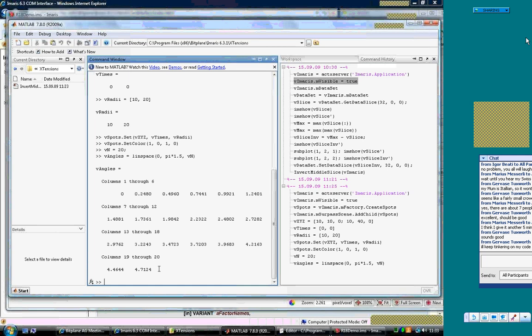So we say the x coordinates are some center value, and then we have to specify some radius to multiply our coordinates.